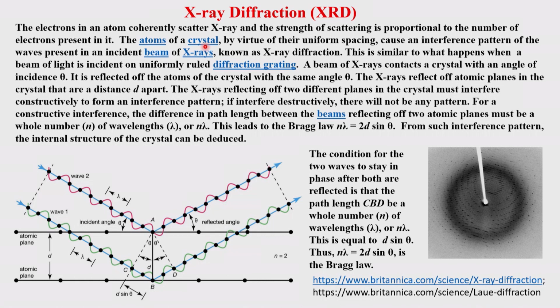So, the interference of the individual scattered beams. These scattered beams can overlay and give either a constructive beam or a destructive kind of result. This is the one which leads to the presence of an X-ray beam there, or the absence of an X-ray beam. So that is called presence and absence. That is what the entire thing makes.